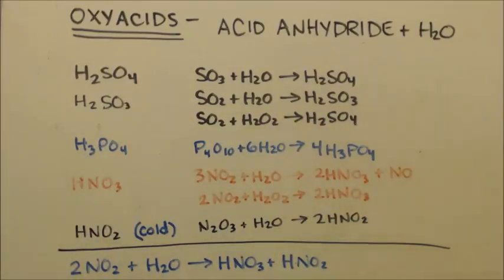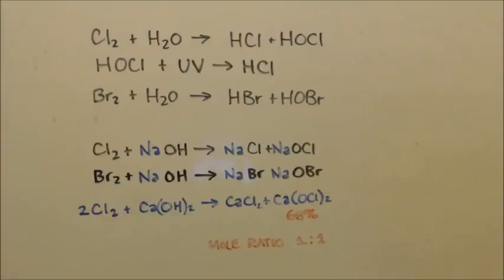And there are always things that can explode or are exothermic. So always ask if you're ever going to do anything that you don't know about, because these are just 15-minute videos trying to give you some tips. This isn't telling you everything. I do have a video on sulfuric acid, not how to make it, but how to get it. I talk about the dangers in there, so maybe you should watch that if you're going to try to do any sulfuric acid. And hypochlorous or hypobromic or bromous acid.